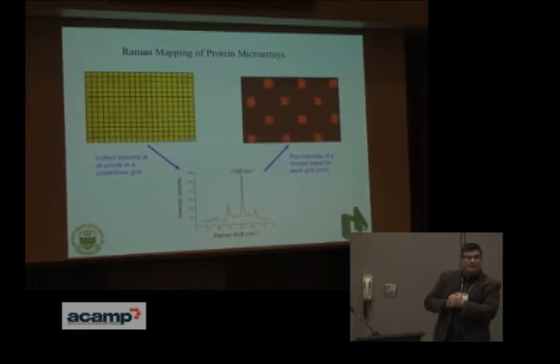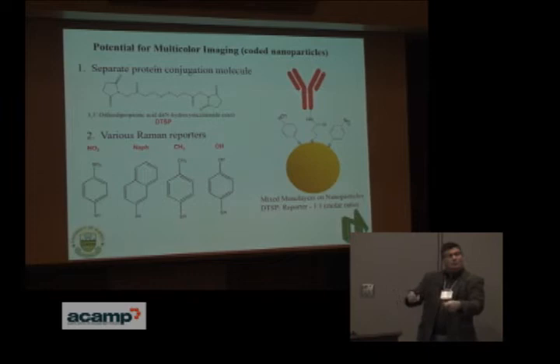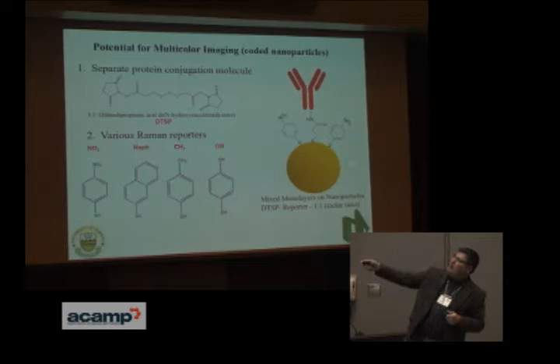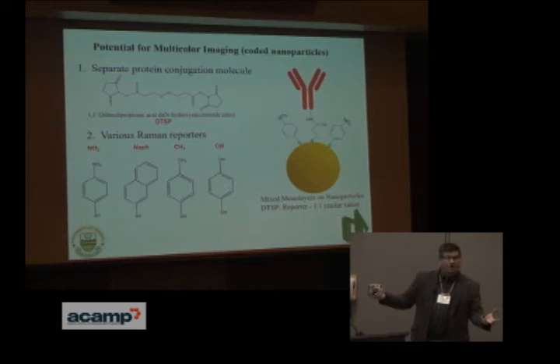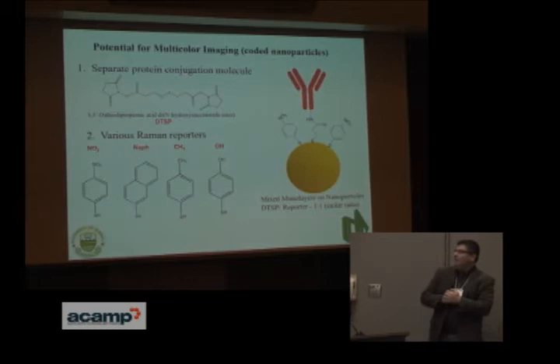And one of the things I mentioned was the ability to detect multiple things on a single chip. And to do that, you need different labels. You need different signals. And so we've created some chemistry where we would make a mixed monolayer on the particle, so two different molecules on the same particle, where one molecule is used to conjugate the protein, the other molecule is used to generate our signal. And these are all commercially available cheap molecules that you can buy, and you just mix them all together, and you centrifuge the nanoparticles, resuspend them, and you're done. And so a variety of different molecules can be used to generate different signals.